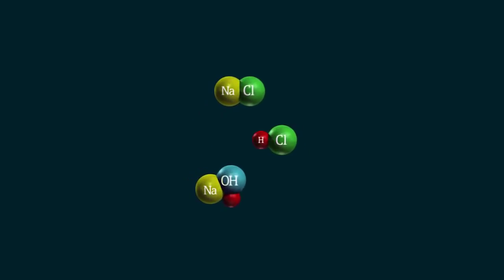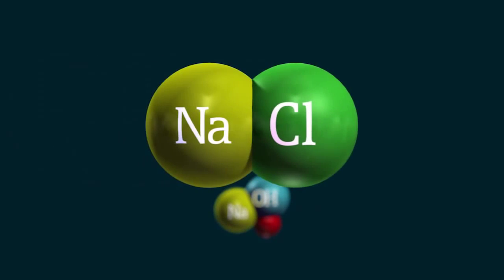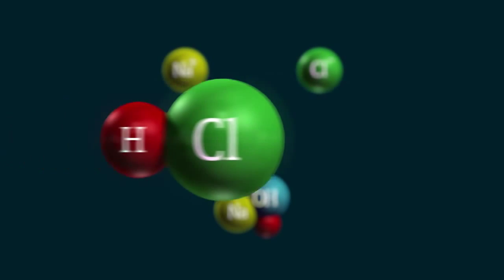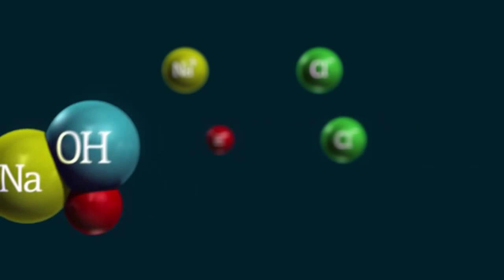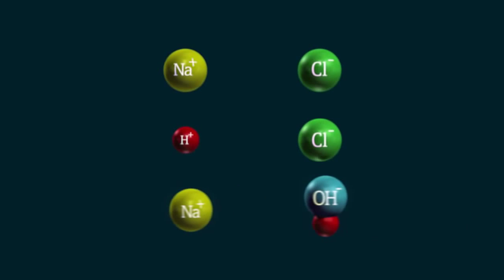Let's start with a closer look at why liquids are conductive. The electrical conductivity of a liquid arises from the dissociation of soluble salts, acids, and bases to form positively charged cations and negatively charged anions. These ions contribute to the charge transport in the electrical field, and thus to the current flow, just like electrons in a metal.